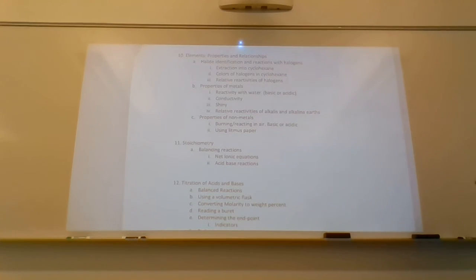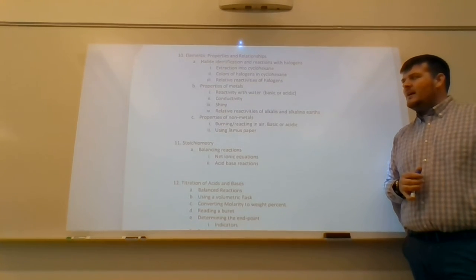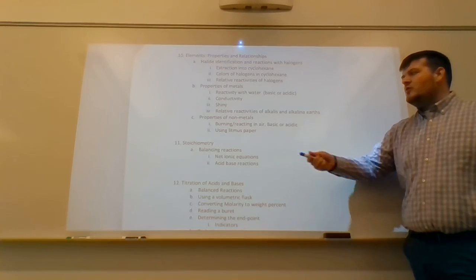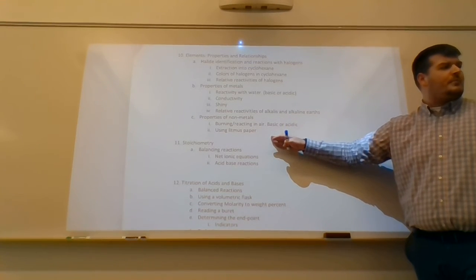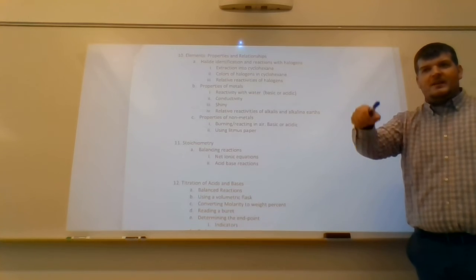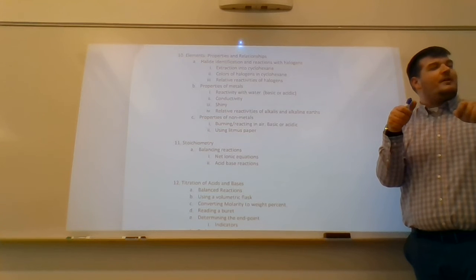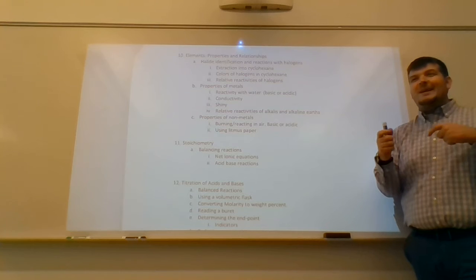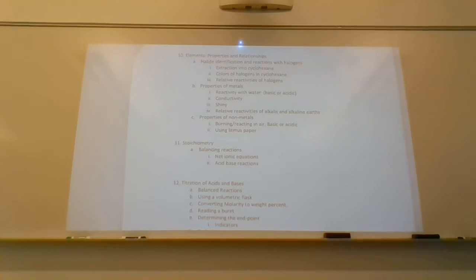All right, so non-metal oxides in water, we say that they turn the water acidic. And then using litmus paper, remember, be very careful. You have to use both litmus papers to prove this to me. Do I take the litmus paper and dip it into the solution? No, I take a glass stir rod and apply it to the litmus paper, right? Because I don't want litmus in my solution. Litmus is actually a molecule. And that's pretty much it for this lab.